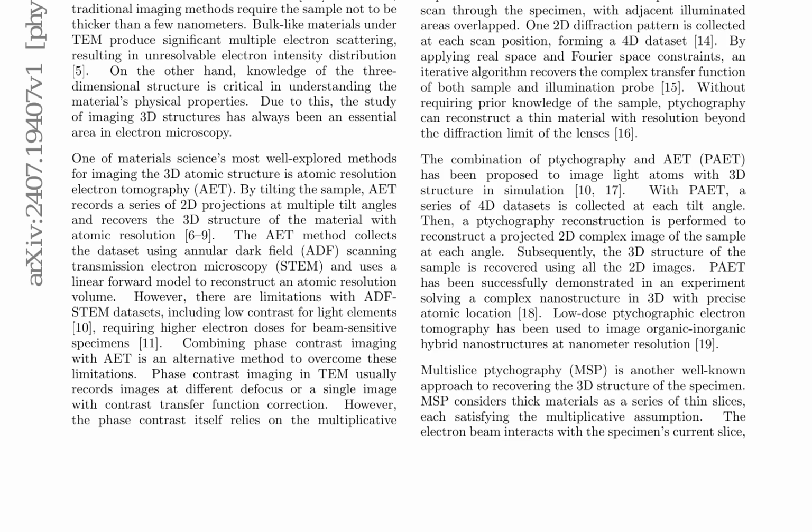The end-to-end reconstruction workflow for 4D STEM data begins with the bright field reconstruction and aberration calibration. The weak phase images are reconstructed using the SSB method on uncalibrated datasets, and the optimal defocus for the bright field reconstruction is used for probe initialization. The multi-slice ptychography reconstruction then produces several slice images for each tilt angle, which are summed into 2D phase projections for joint reconstruction and alignment.